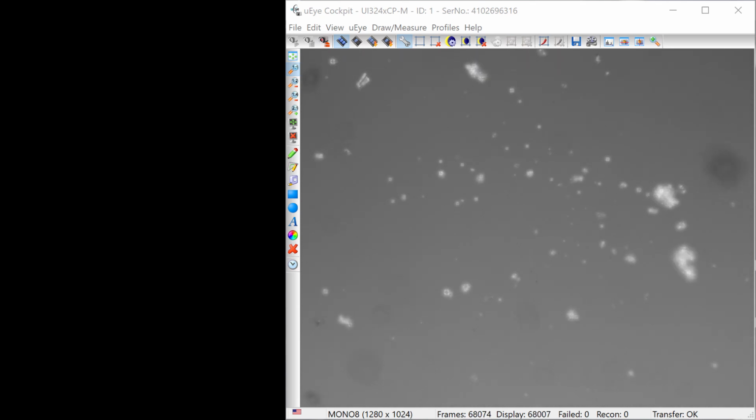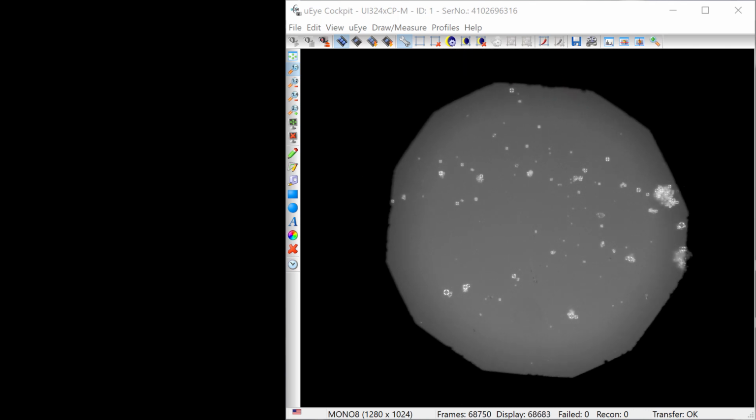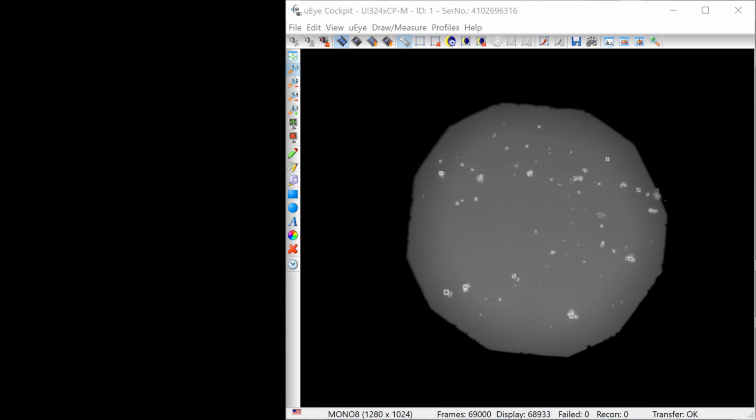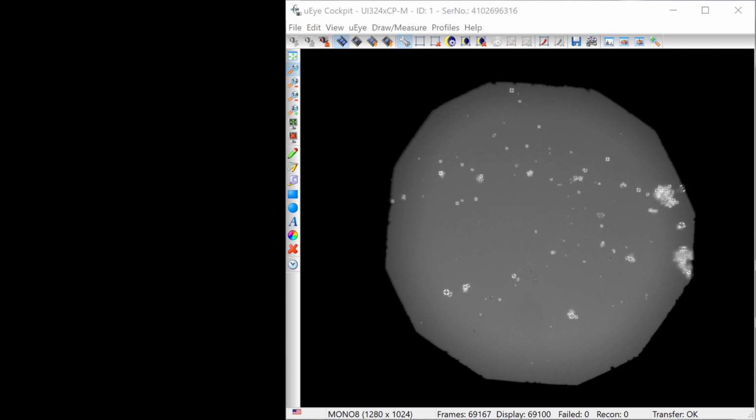To set up Köhler illumination, I first find the specimen and focus on it. Next, I'm closing the field stop. As we see, the outline of the aperture appears sharp and in focus at the same time as the specimen. This isn't surprising because the reflected light image of the field stop is produced at the top surface of the glass cover slip, which is also the surface on which the glass powder rests.